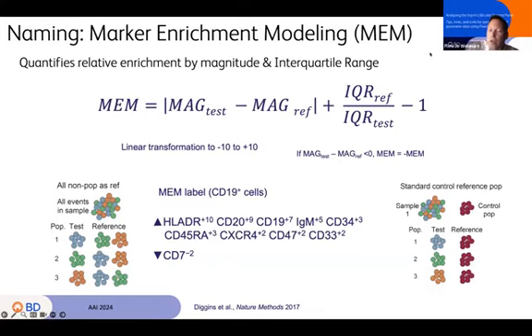And so you'll notice there's a minus one term that's lumped into this. If you get similar interquartile ranges, this term just goes away. Okay, so it's a catch-all for any kind of really messy bad population.